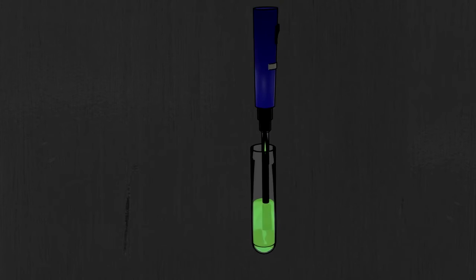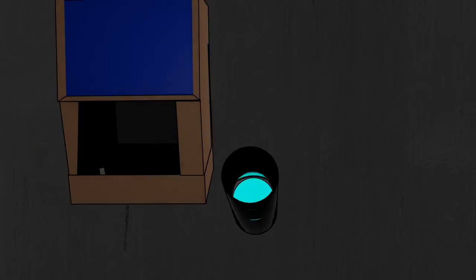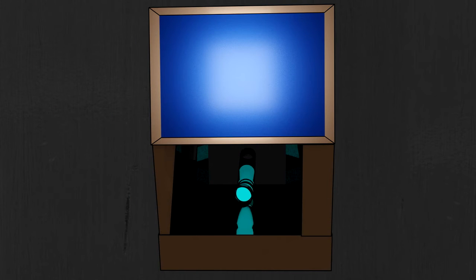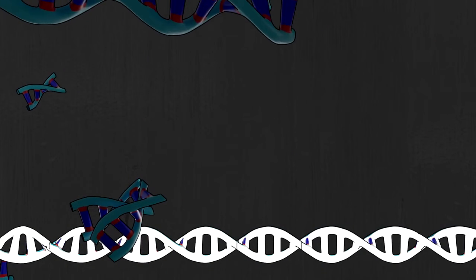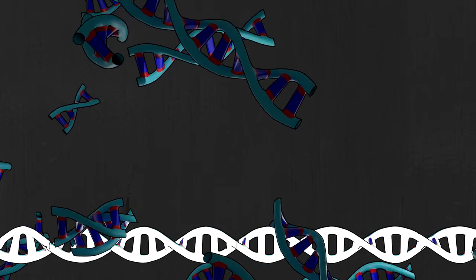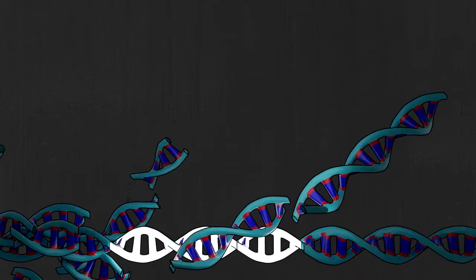The RNA is isolated, fragmented, and randomly primed in a series of chemical treatment steps to prepare it for sequencing. The RNA-rich liquid is placed into an RNA sequence analyzer and processed. Once each fragment of RNA has been tallied up in a raw read, fragments are aligned with a mouse reference genome. The number of fragments at each point along this genome is recorded.